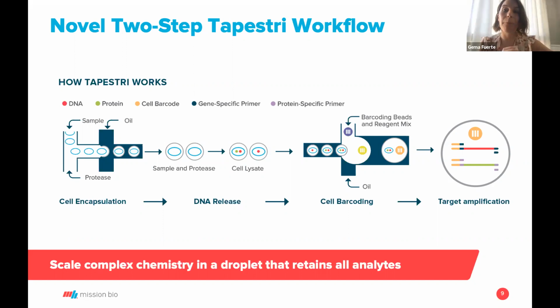We have a universal nuclei isolation protocol on our website that we can share to help people achieve single nuclei from a frozen tissue piece. So in terms of single, you answered the question. We got clarification. The question is, how do you obtain single cells specifically from a frozen sample or a biopsy?